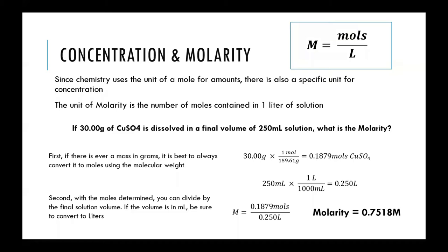While you may have been converting grams to moles and moles to grams before in maybe some other labs or in lecture, this experiment is really looking at the concept of molarity. And molarity is a chemistry unit of concentration. There are many different types of concentration units. You can have percentage, you can have parts per million, you could have mole fractions. These are different ways to express a concentration.